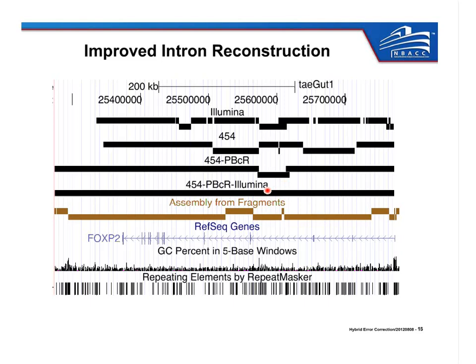And one takeaway here is that the Illumina data does seem to do a better job than the 454 data with these high GC windows. The gaps that are left in the 454 corrected PacBio assembly are in the higher GC regions, which is likely because we have lower depth of 454 sequencing, and we couldn't have enough data to correct the PacBio accurately in those regions with high GC, whereas with Illumina we maybe didn't have the full depth of coverage, but we had enough coverage that we could accurately call the consensus of the PacBio corrected reads.